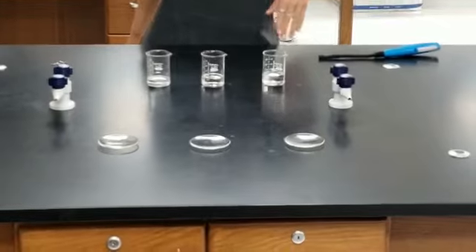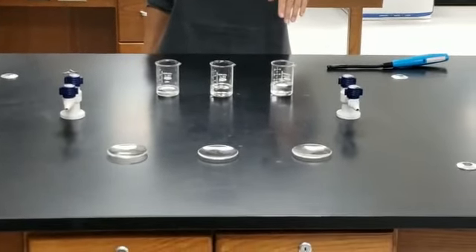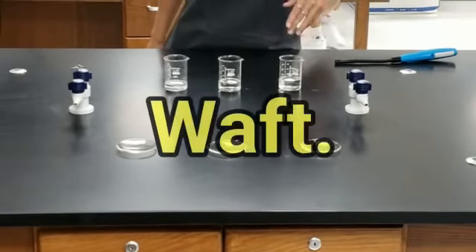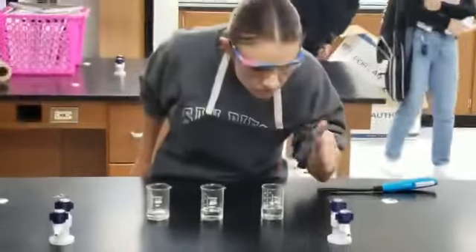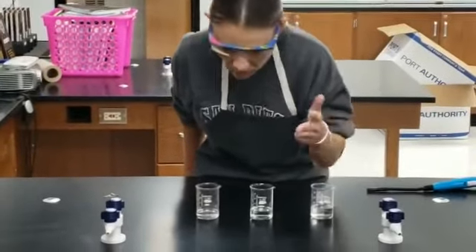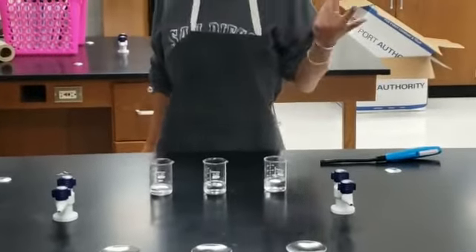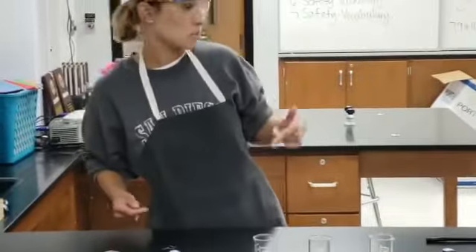Maybe by smelling it — but it's not a great idea to directly smell the liquid. The proper way to do it would be to waft. This one doesn't smell like much. This one has an odor. This one has an odor too. But it still doesn't tell me much about those liquids, so I'm going to run some tests.